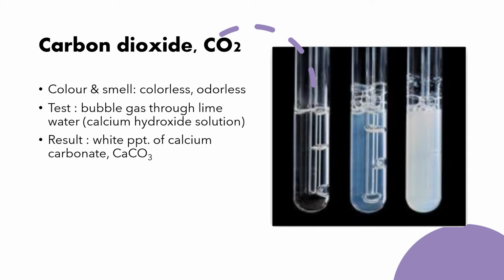Carbon dioxide, CO2. Color: no color. Smell: odorless. The test: bubble the gas through lime water, or calcium hydroxide solution. The result is a white precipitate of calcium carbonate, CaCO3.